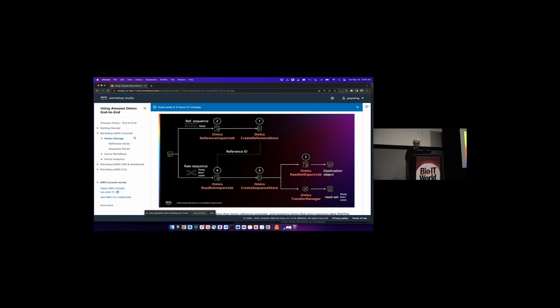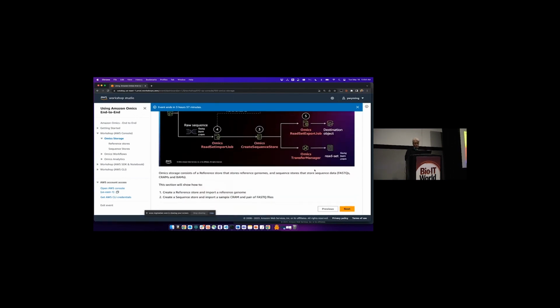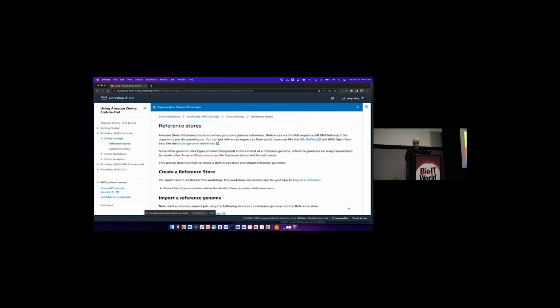And then, yeah, let's get into that. If you have any questions along the way, this guide should be here for you for the resource or instructions you need to do. Otherwise, we're floating around the room. Okay. You have the cancer genome loaded into it.